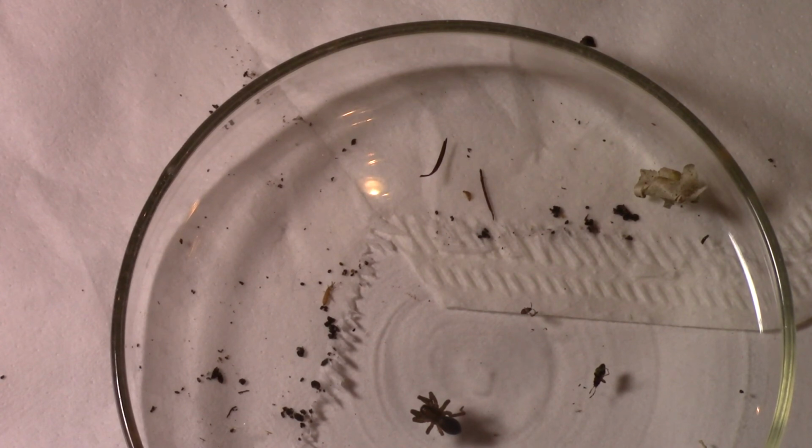I'm trying to make this as adaptable as possible. Work with what you have. So if you only have what you hand sorted out, that's great. That's what we'll work with. If you only have things in your Berlese-Tullgren funnel, that's great. That's what we'll work with.